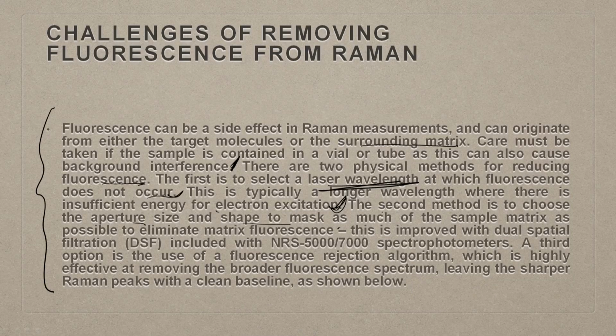It's truly not easy, because controlling the aperture and getting exactly the right sort of picture demands a lot of practice. Unless you really play with the lenses and the laser in the right way for a prolonged period of time, you will be at a loss at times. So you have to be extremely careful when you talk about this.